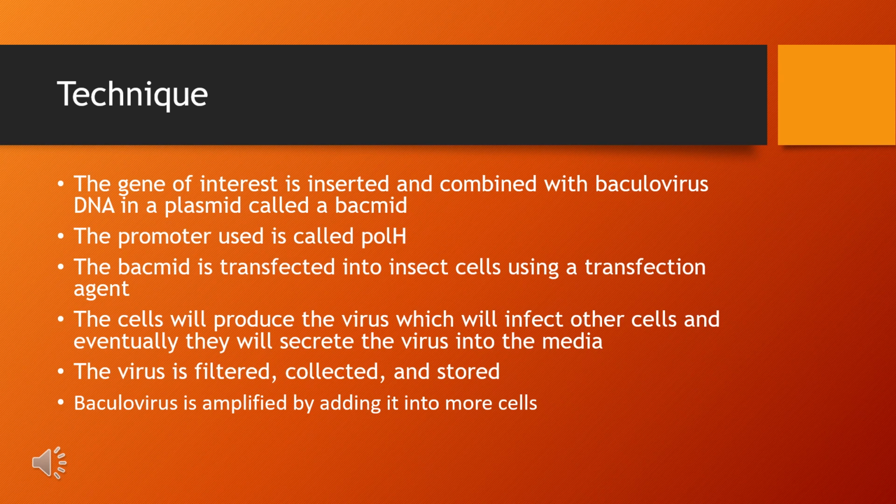So now I will go over the general procedure of using a baculovirus expression system. The procedure is very long and there's a lot of steps, so I'm just going to give a brief overview, but there's a video in my references where the girl goes into depth and shows every step, and it's pretty cool. But this is my overview.